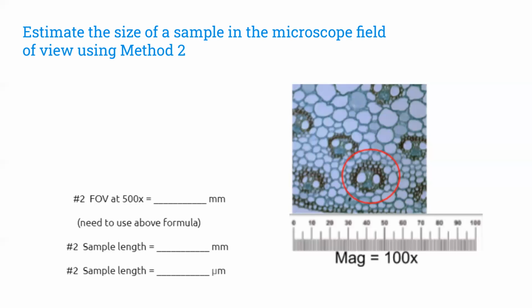Good. It's 1 over because we measured that 3.5 would fit, right? If I had 3.5, they would fit this way. But we only want to measure one of them. That's why we measure 1 over 3.5, because we want that fraction of the whole field of view.